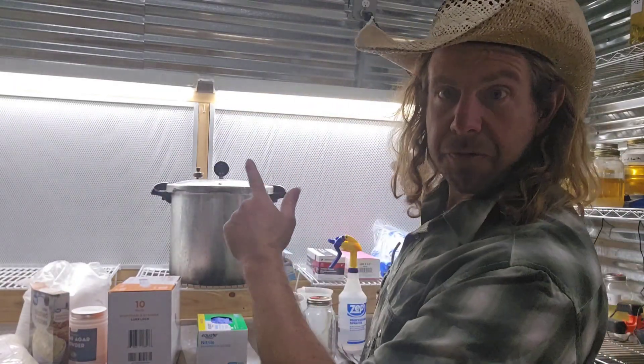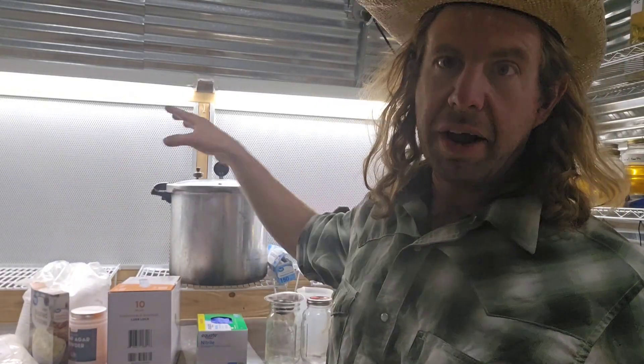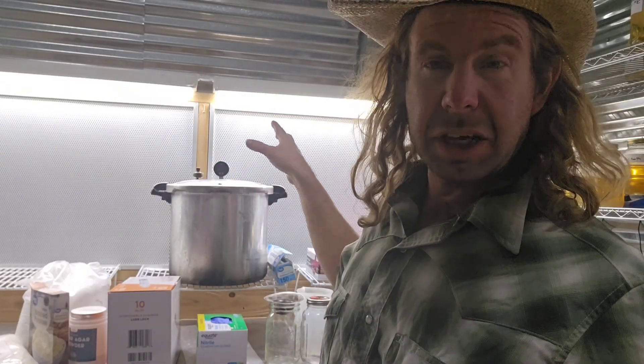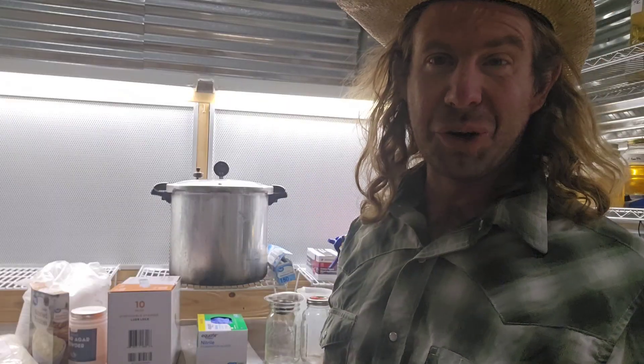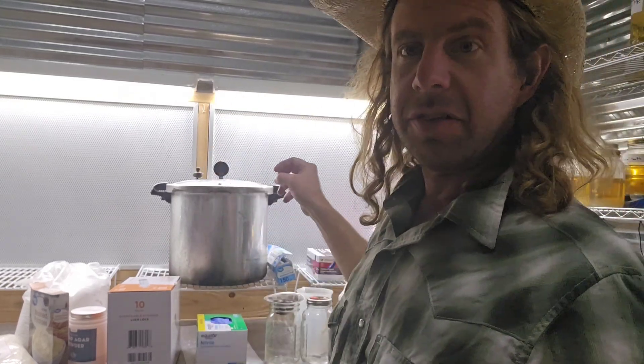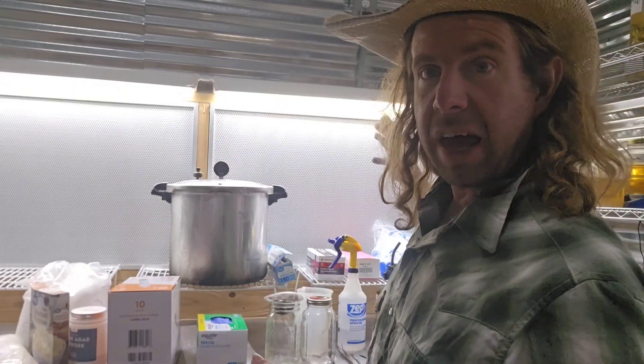The first item is the laminar flow hood — that's this big item right here behind me, these two white filters. I built this laminar flow hood myself; this is the third one I've built in my mushroom growing career. You can also buy filter fan units or use a still air box if you want — just another way to do your sterile work. But I prefer a laminar flow hood because this is where I work every single day to do my sterile work and lab work. Number one: laminar flow hood.